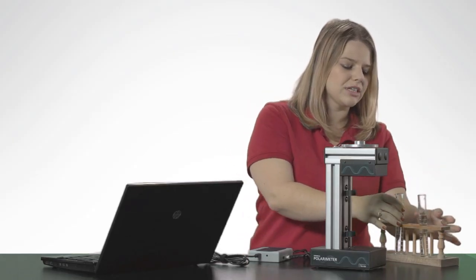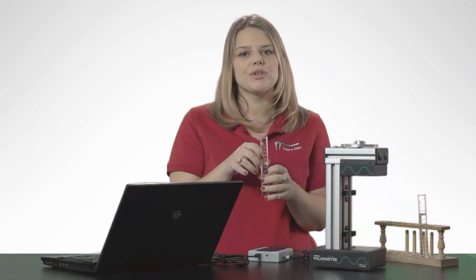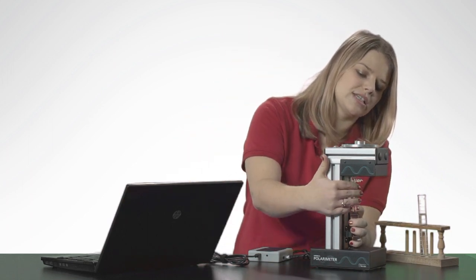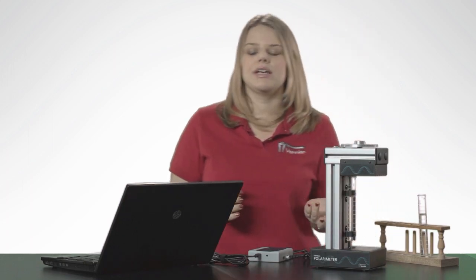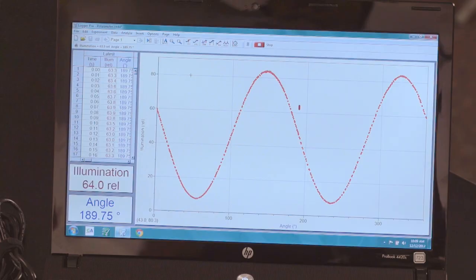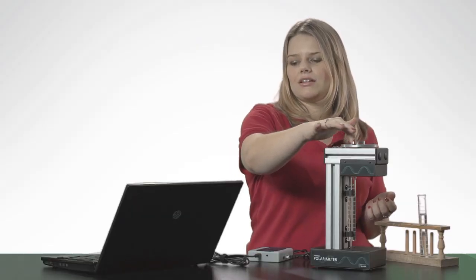Now I'm ready for my optically active sample, which is a 30% sucrose solution. I've also filled this one to 10 centimeters. Place it in the polarimeter, begin data collection, and rotate the analyzer.